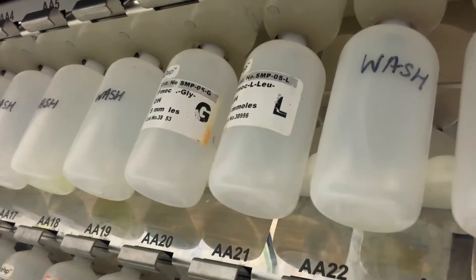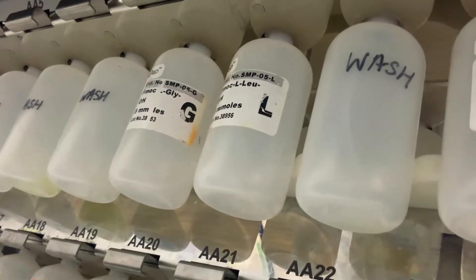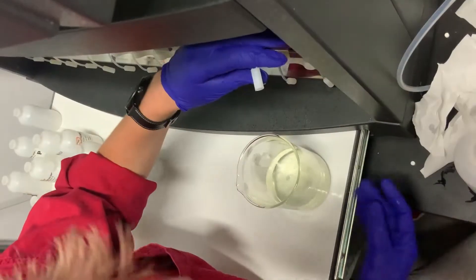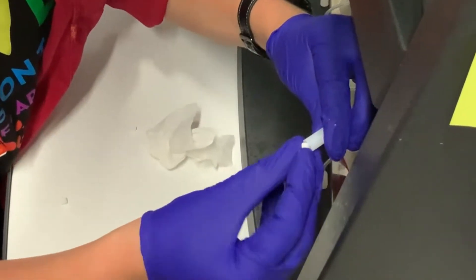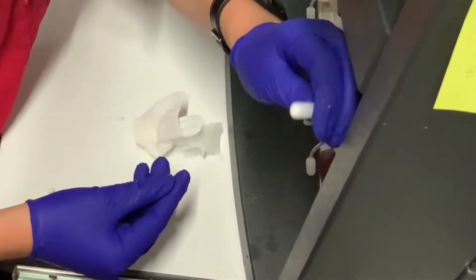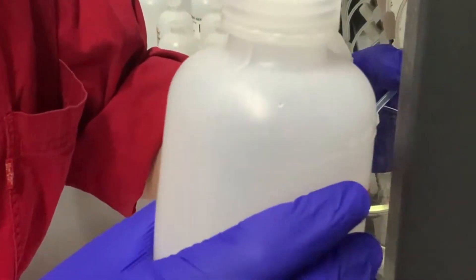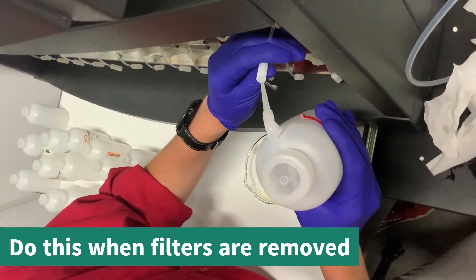Once the system clean is complete, the wash bottles will have collected DCM and any residual waste from the lines. Dump out this waste and remove the old filters. Rinse the line and adapter with ethanol. If there appears to be any clogs, you can squirt the ethanol up the line.